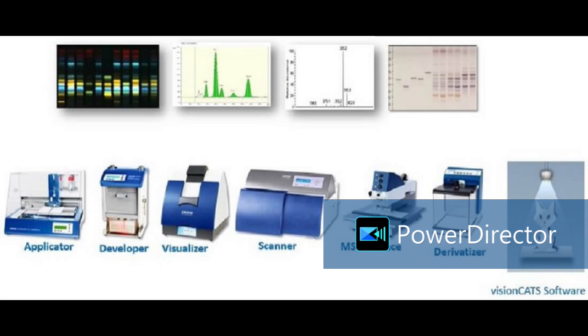into MS. Standard tadalafil shows 390 molecular mass, and in the sample tadalafil also shows 390 molecular mass, in positive mode and in negative mode, in standard and sample. So this is standard, this is sample. Not visible under 254, visible under 288 nanometer. Based on the peaks found at particular RF values, we made markings here and eluted these two bands, standard and sample. So that is the speciality of TLC-MS.